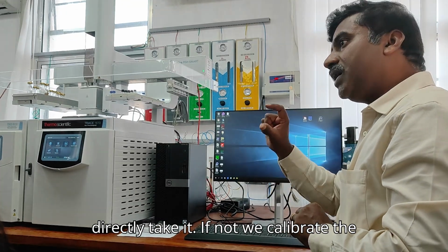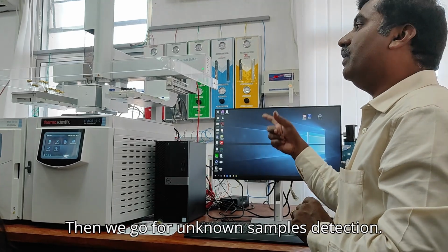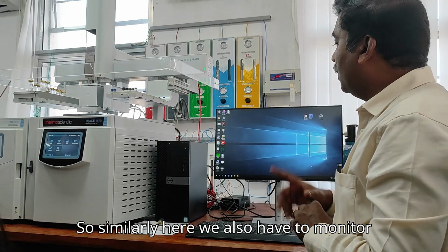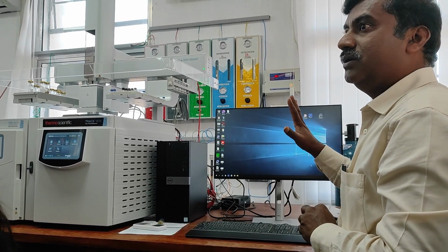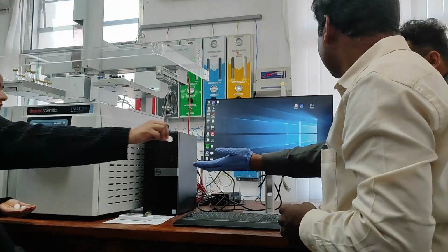If not, we calibrate the pH meter to read the proper pH, then we go for unknown sample detection. So similarly here we also have to monitor the system first. Once it is giving proper data or confirmation, then we can proceed for unknown sample detection.